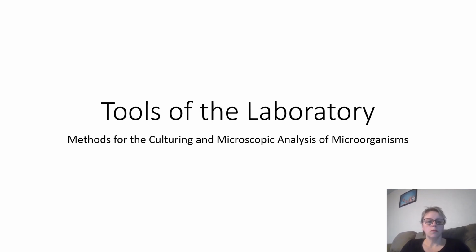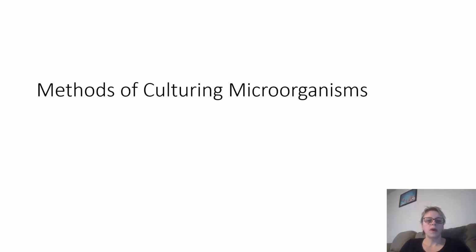Tools of the laboratory. Methods for culturing and microscopic analysis of microorganisms. Methods of culturing microorganisms.